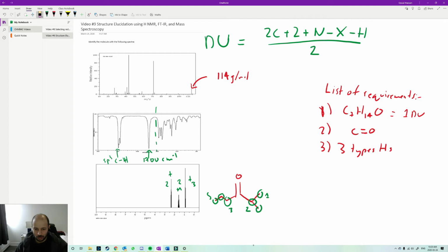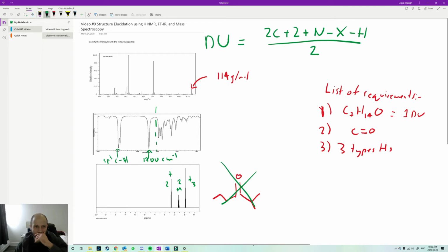I'm just going to delete these annotations. Oh, I did not mean to delete that. I'm going to redraw this just so that you guys see that this compound does not work. Right? That doesn't work. Okay. What's another option? Well, I could go ahead and do something maybe kind of like this.